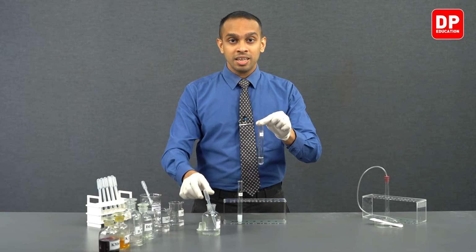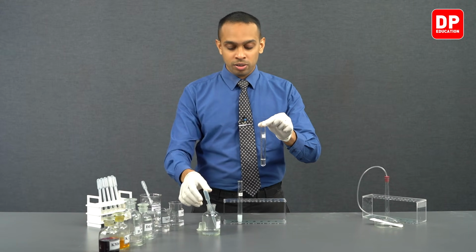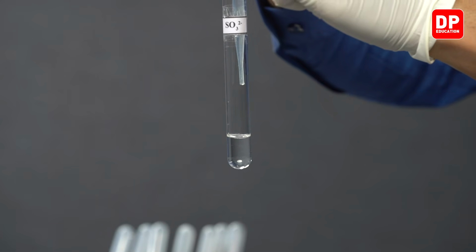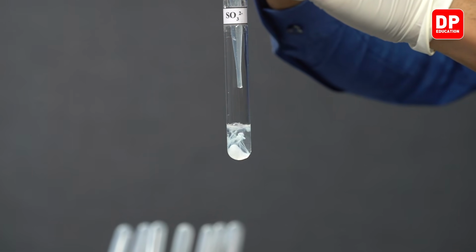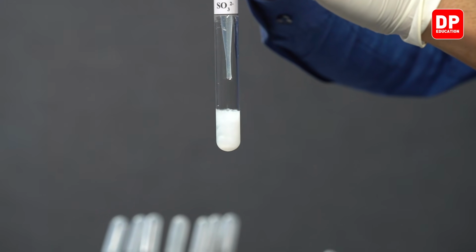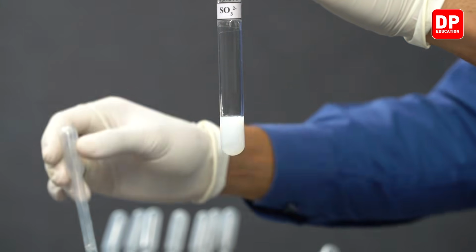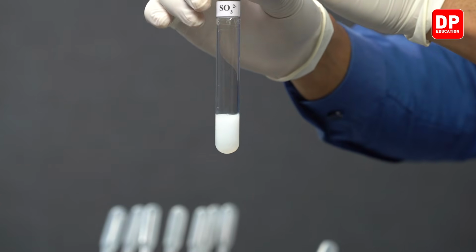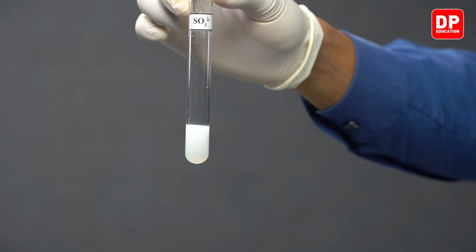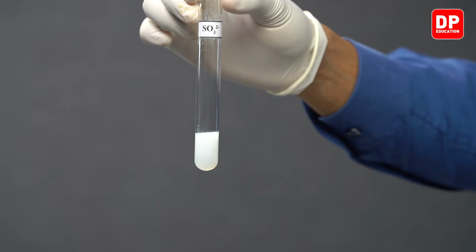To it, let's add a small amount of barium chloride. And you are going to observe, as we add barium chloride to sulfite ions as well, we are forming a white color precipitate.